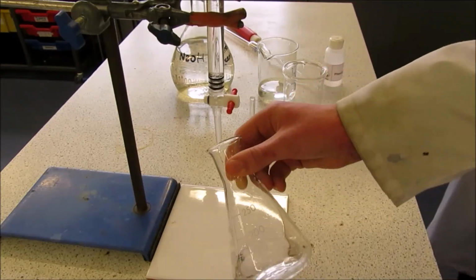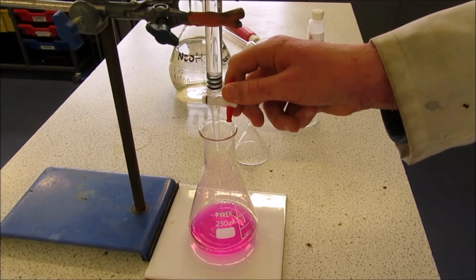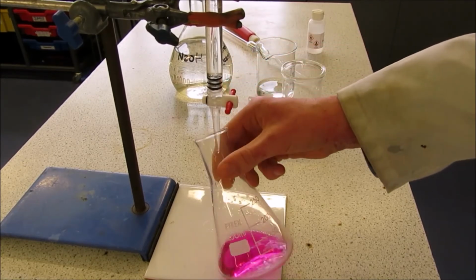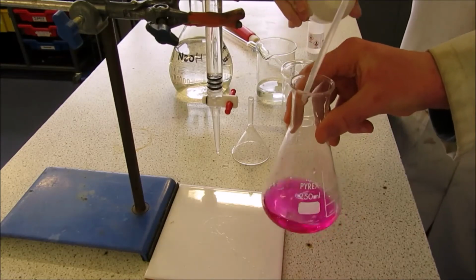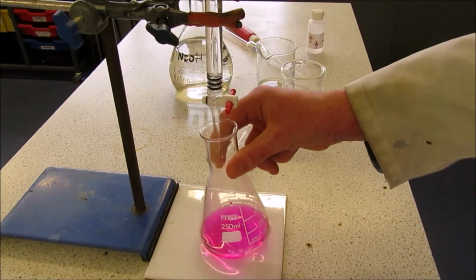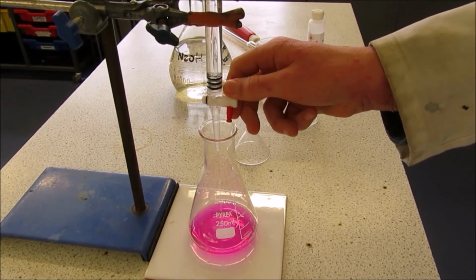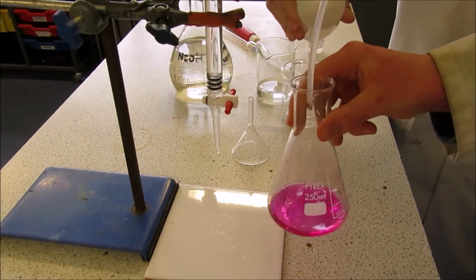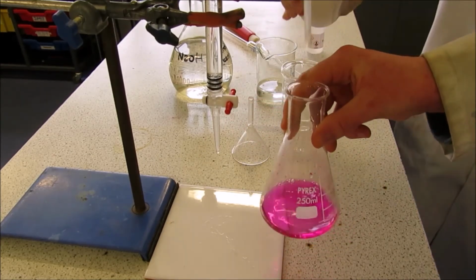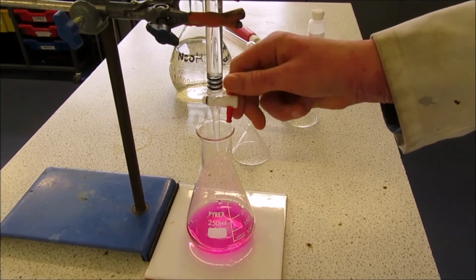Then, using this value, perform another titer, allowing acid to flow a few drops at a time, swirling the conical flask vigorously in between the addition of acid. Repeat until concordant results within 0.1 centimeters cubed have been achieved. It may take you several attempts. After each titer, rinse the conical flask thoroughly with deionized or pure water before refilling with the unknown solution.